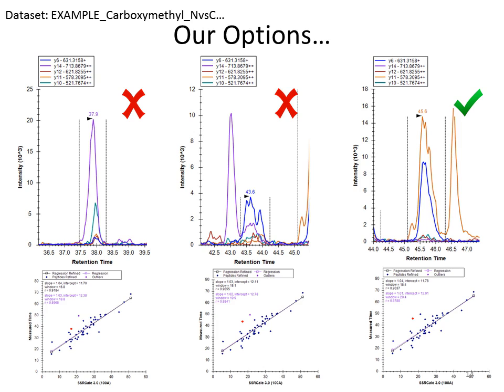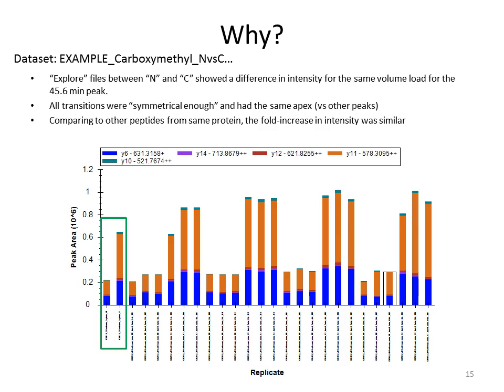So one way that we can figure out if we like it or not, right, is we generate more data. So we had normal and cancer samples. And the goal, obviously, is to find some kind of response difference between the two. Whether it's up or down, we didn't know. So here is the normal, and here's the cancer for that peptide that had the green check next to it on the previous slide. And so we went through, and in the case that you're not sure, I don't want to say that you can pick several peptides at different retention times, because you really can't in Skyline. But what you can do is target for the span of time over which all of those peptides are eluting, and see which one gives you this kind of response.